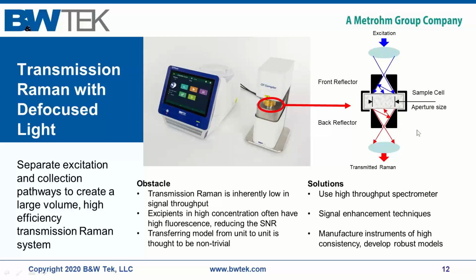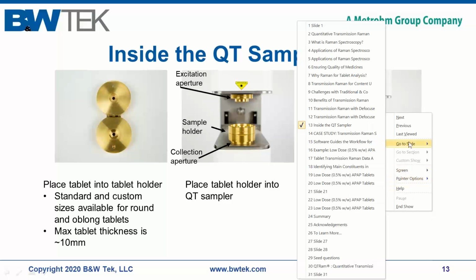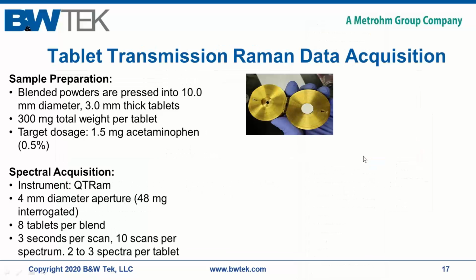Our next question, does Raman spectroscopy require sample preparation, or can it just measure the tablet as it is? The tablets are measured as they are, yes. There is not further sample preparation that's required, so I don't have it shown here, but let me get to my screen where I do have it, and you should be able to see the tablets here, right?